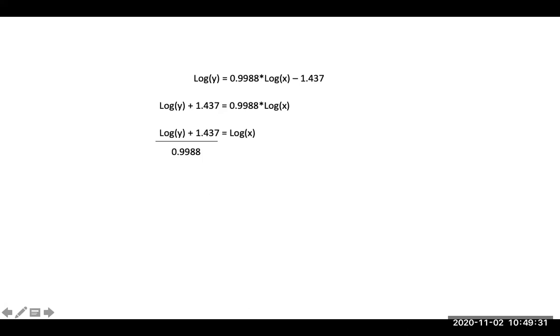Hopefully this will give you the information you need in order to successfully complete the ELISA Labster simulation. Let me know if you have any questions.